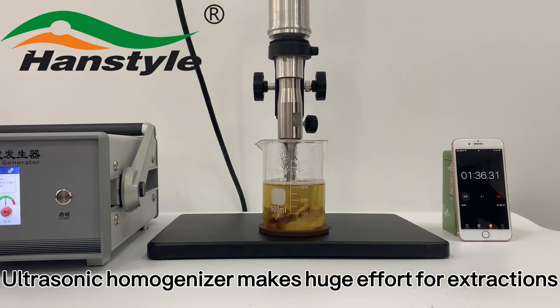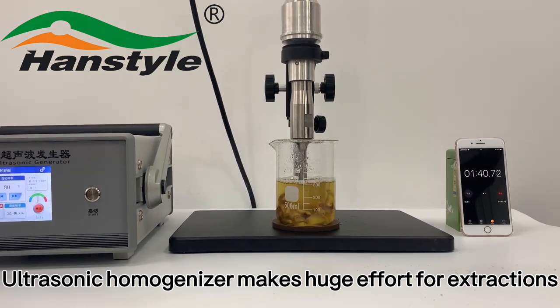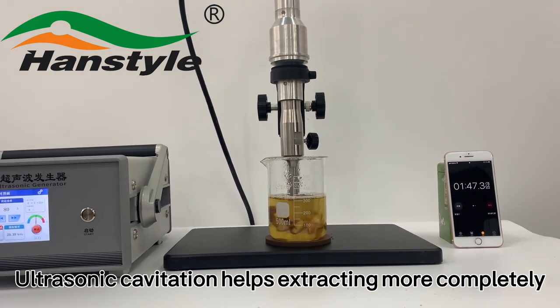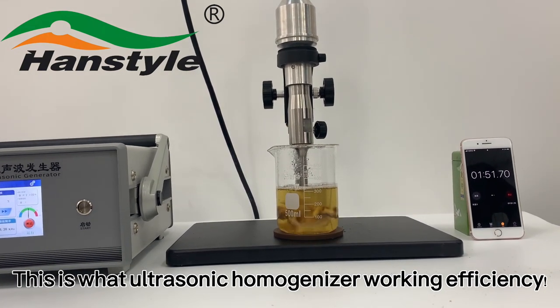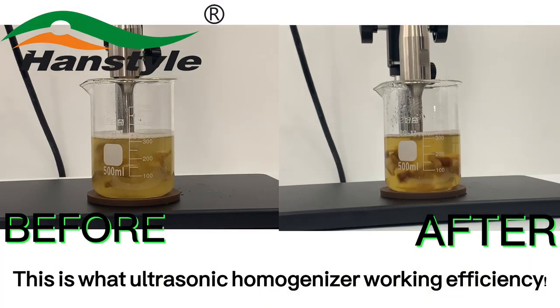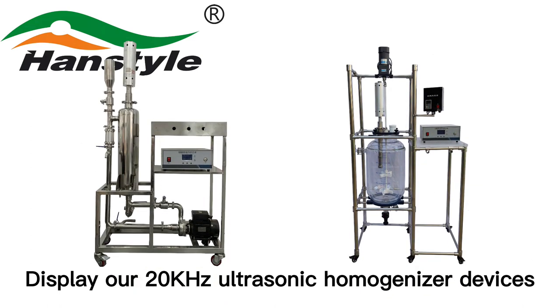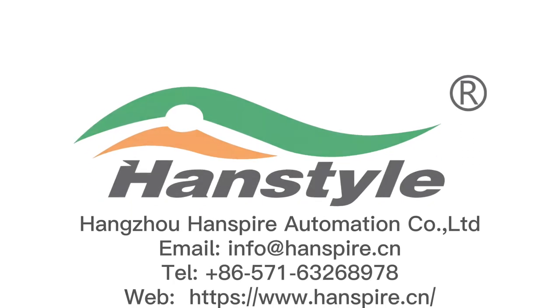The ultrasonic homogenizer makes a huge effort for extractions. Ultrasonic cavitation helps extract more completely. This is what the ultrasonic homogenizer working efficiency looks like. Our 20 kilohertz ultrasonic homogenizer devices — welcome to contact us if you are interested.